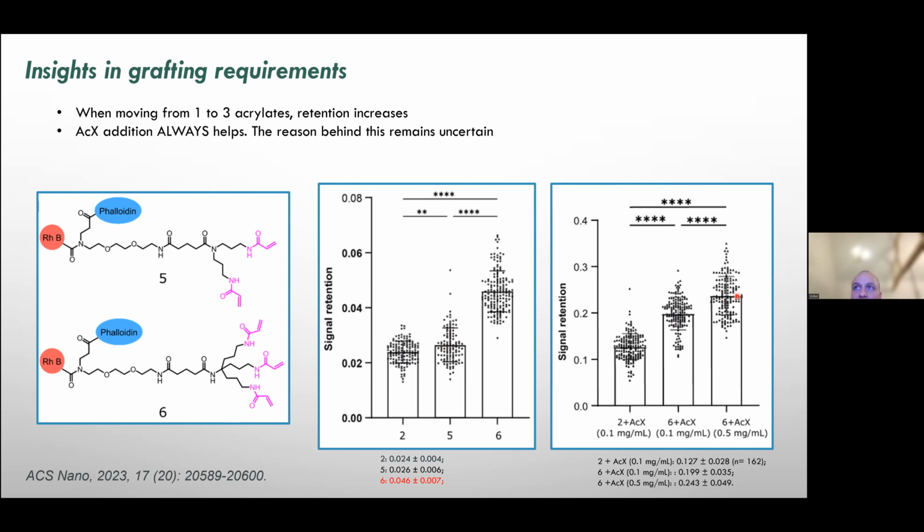Now on the right here, this is an interesting thing. You see these reagents, but then with the addition of ACX. What's the message here is that ACX addition always helps. This is something that we have seen in all our experiments. We've also seen it in literature and from competitors. ACX, for some reason, always increases your signal.